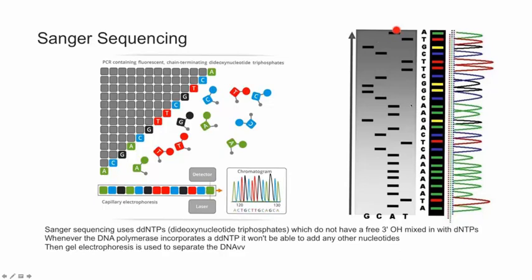As you go up the gel, these bases actually tend to get a little closer to each other in terms of size. And so you have resolution problems as you start to get past maybe 150 to 200 bases if you were using one of these older radioactive gels.